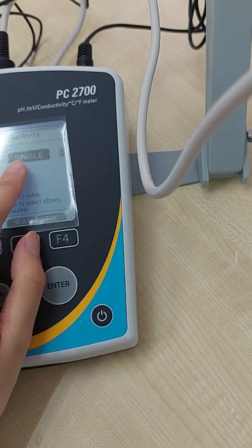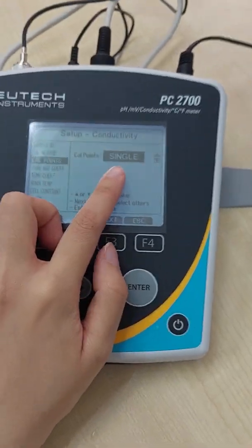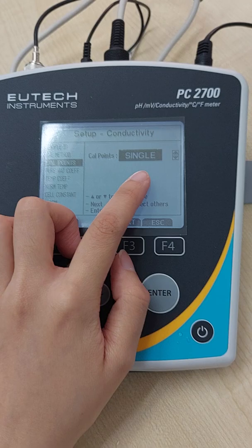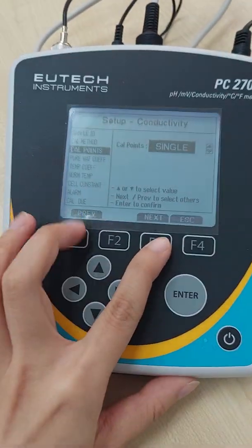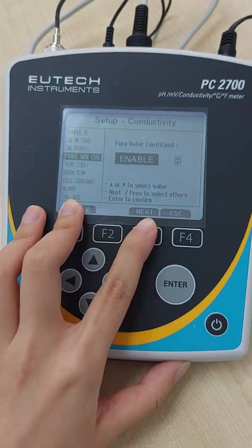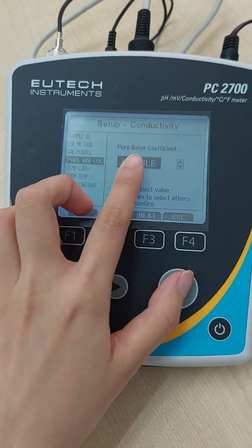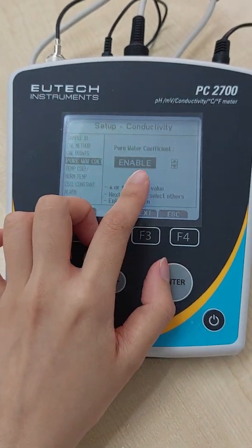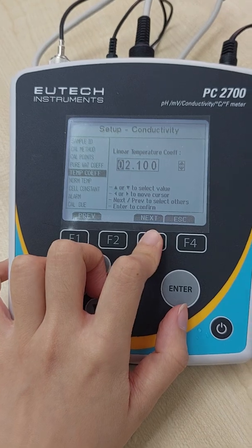Cal point, usually single point will be sufficient, whichever that is closer to your sample. This one is for the pure water. Usually we just leave it on.